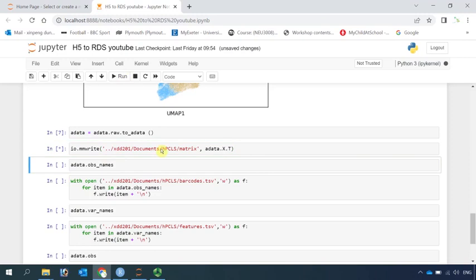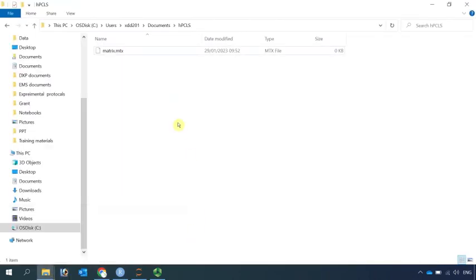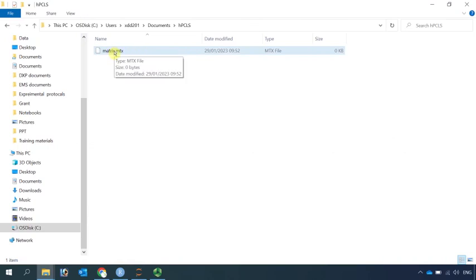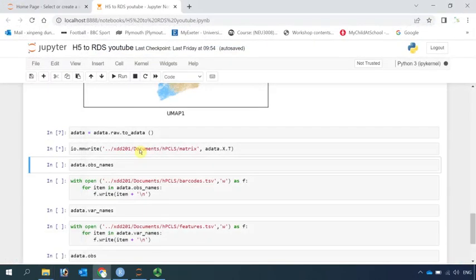Because the size is very big, it takes time to write the matrix data. I saved the matrix data in the human precision cut long slice folder. You can see we have a matrix data file already here, but the size is 0 — that's because Python hasn't finished writing yet. It's done now. You can see the changes from the asterisk to number 8. So we wrote the matrix data.